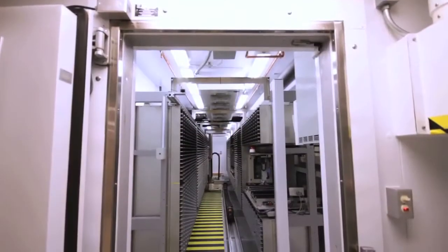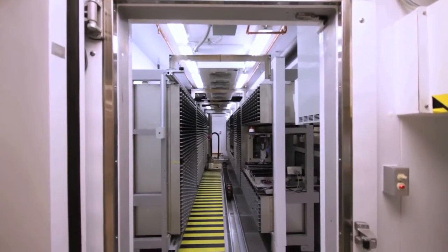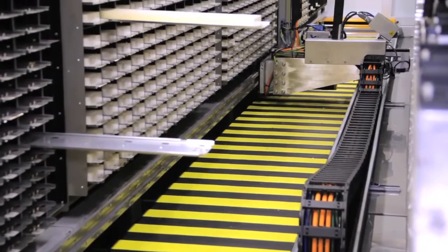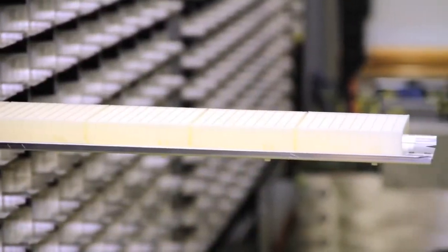At the heart of the solar dizygotic system is the home base section, which consists of a minus 20 degrees Celsius storage freezer that can hold up to 4,000 microplates and 1.4 million tubes.